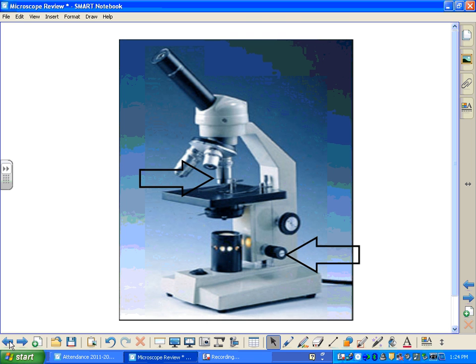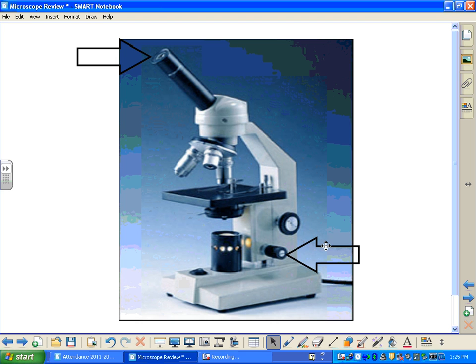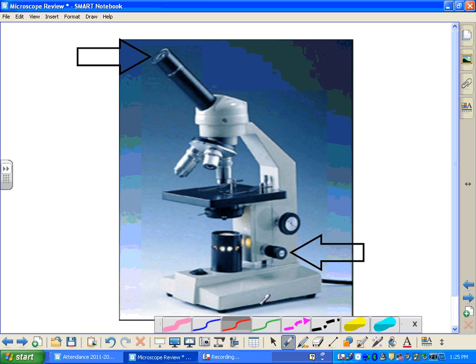Now we're ready to switch to high power. We're going to take our high power lens and rotate that down so it's pointing to the specimen, then look through our eyepiece. Here we can see our specimen magnified even further under high power. If your image is blurry, you're going to want to take your fine adjustment knob — and only your fine adjustment knob — to focus on the specimen. You would not use your coarse adjustment knob under high power, as it moves your stage too quickly, and since your high power objective will be very close to your slide, you do not want your stage moving very quickly.